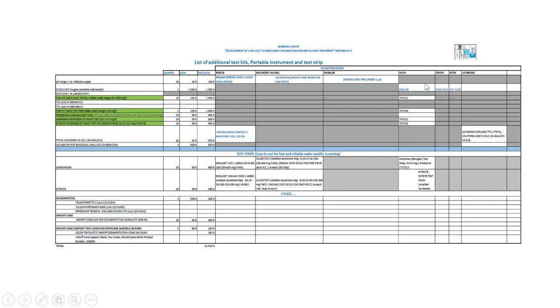a price. There are HACH, Orion, WTW. The price in Europe is this. I don't know what is the price in your country. Okay, about BOD, I think it is possible only in a laboratory. So no, I haven't any idea about it.